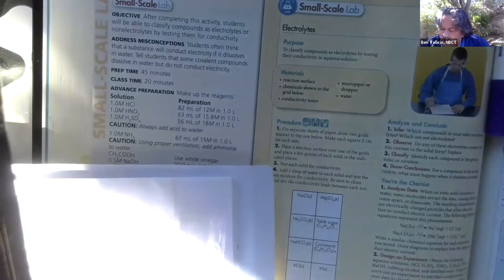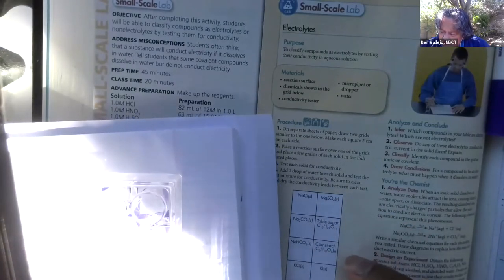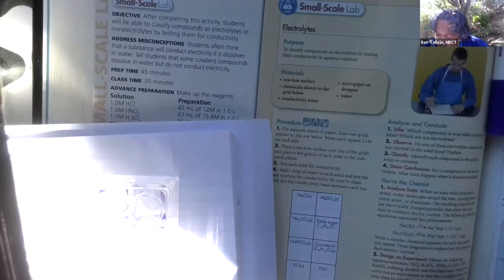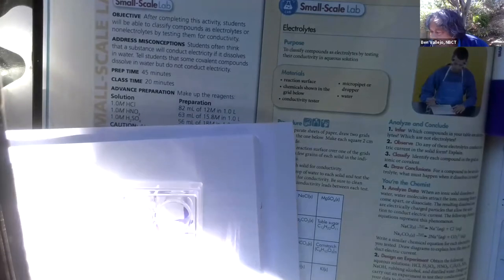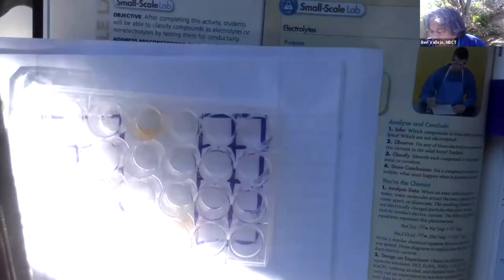Okay, so anyway, I got my solids in there. I know it's a solid because I had an S after it. So the solids are... Oh, all these are solid, aren't they? Sugar, cornstarch, yeah, all solids, KI, KIS, and KCL.